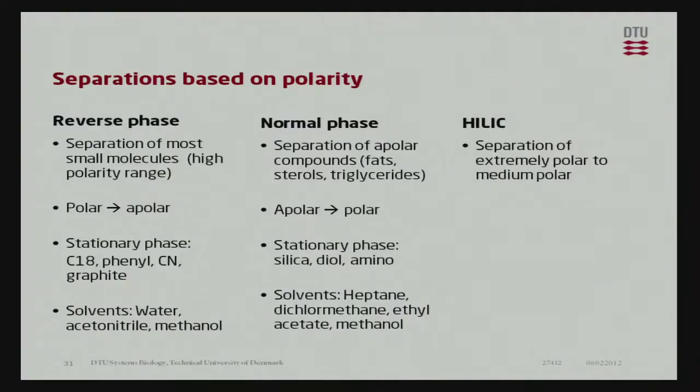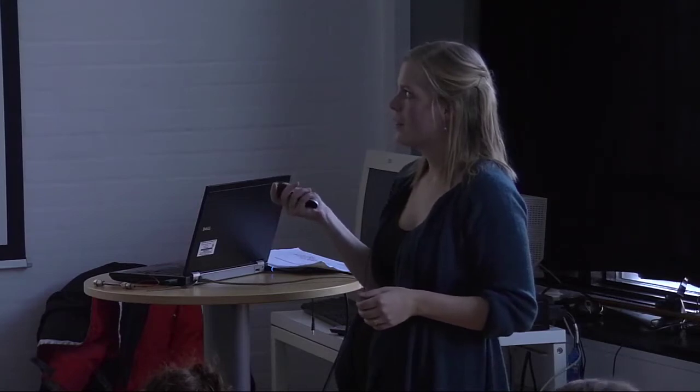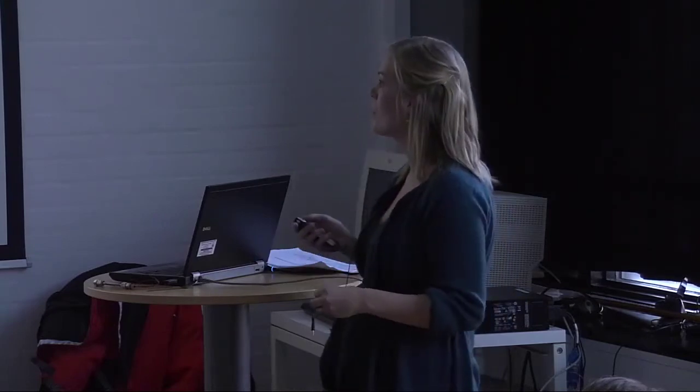Then we got hydrophilic interaction chromatography. And this is where we have the extremely polar to medium polar compounds. It's a newer method. If you got normal phase, the old-fashioned way, this is the modern way, and this is the really modern way. So not a lot of people use HILIC, and not a lot of people understand exactly how HILIC works. It's one part chromatographic science and one part black magic. Still, it's good to know that you got the possibility. You'll be the ones moving chromatography into a new era where we actually know how to use this method properly.